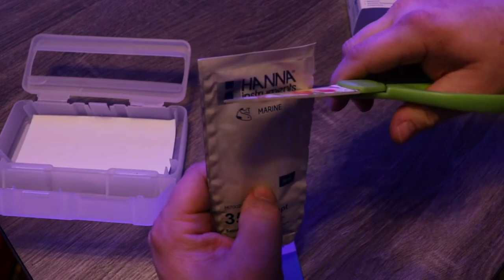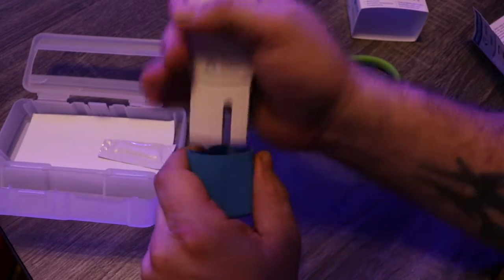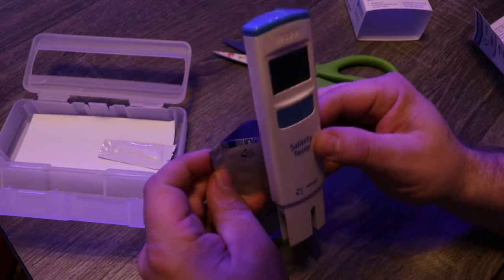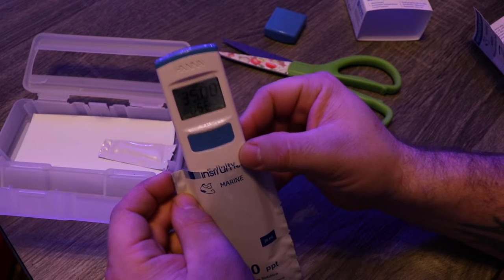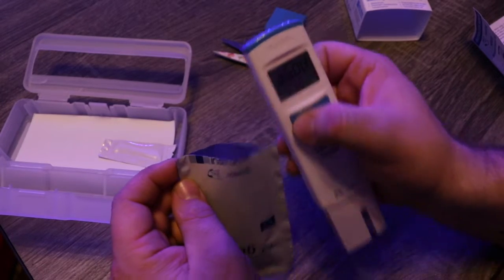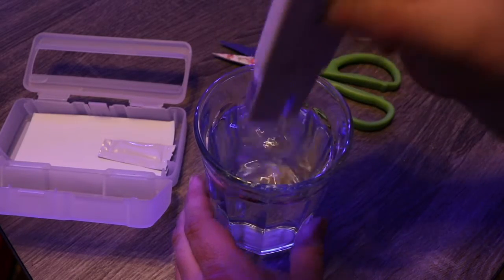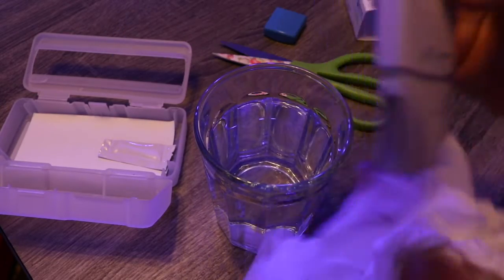We're going to hold the calibration packet upright and cut it. Remove the cap and hit the calibration button. Once it's showing the calibration prompt, put the probe into the packet. Make sure the electrodes are submerged, then hit the power button. Now rinse the probe in RODI water to remove all the calibration solution and dry it with tissue.